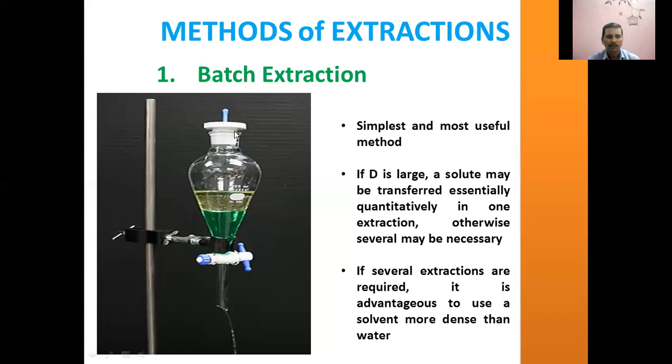Then the organic solvent will be taken and poured into the separatory funnel. The separatory funnel stopper is closed. Then it will be shaken for 30 seconds or 60 seconds. Then it will be made to stand, in standby mode, in order to equilibrate the two layers.